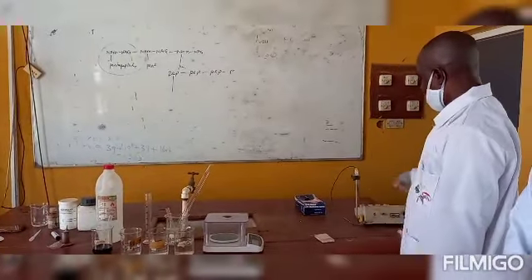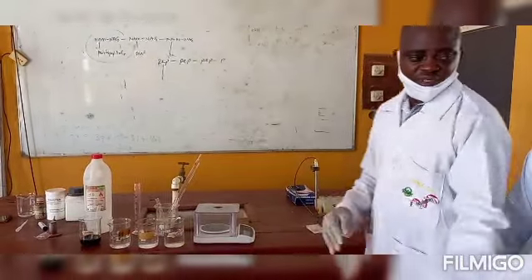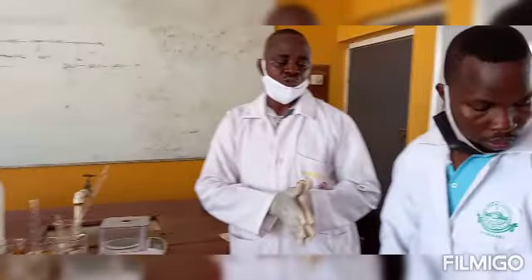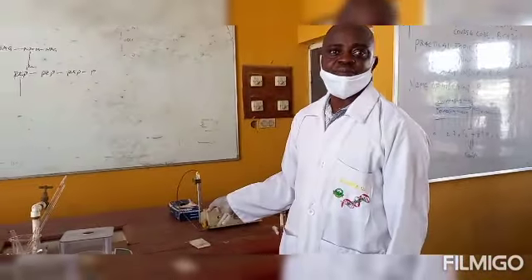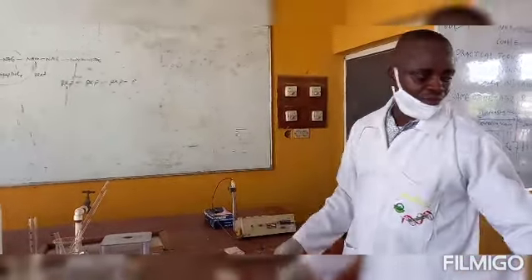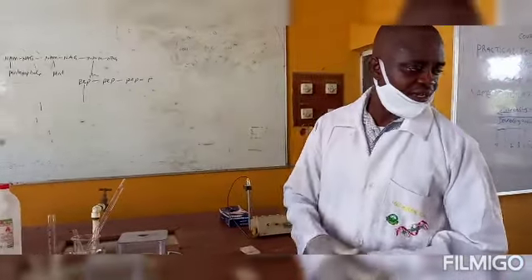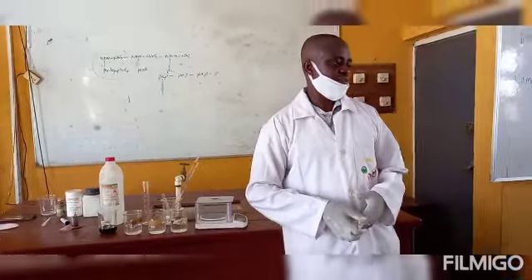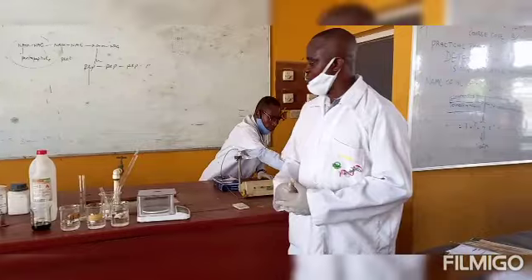I've shown you this earlier on. This is a pH meter. Instead of this laborious work we do now, measuring one by one, using different glasswares and apparatus to take measurement, the machine can determine the pH of the solution immediately without going into all this stress. But as a student that is learning as a scientist, it is required of you to be exposed to laboratory method.